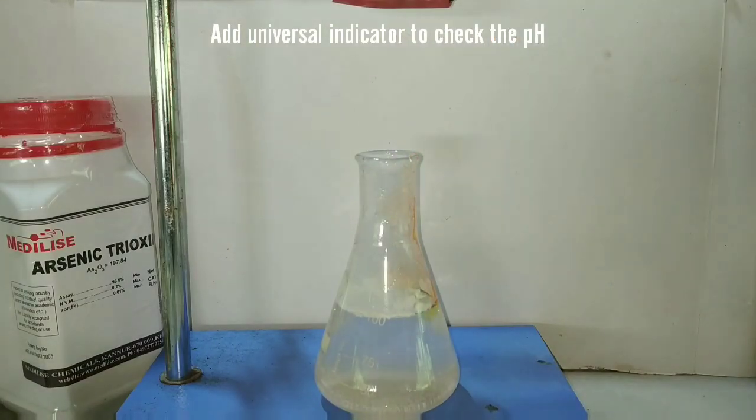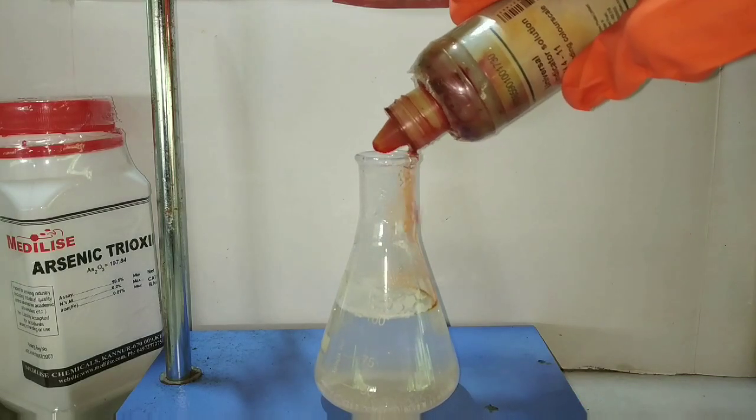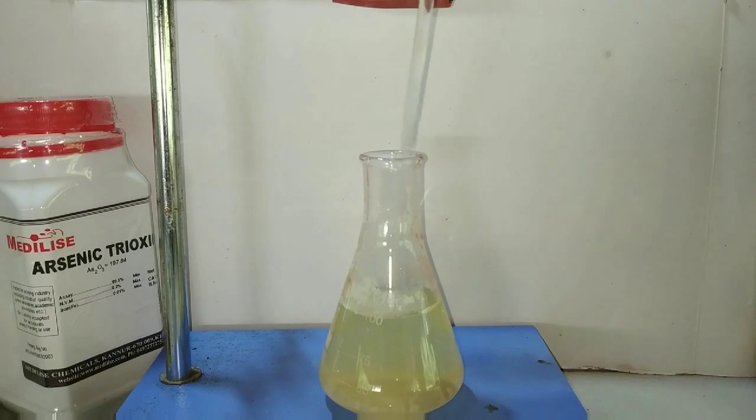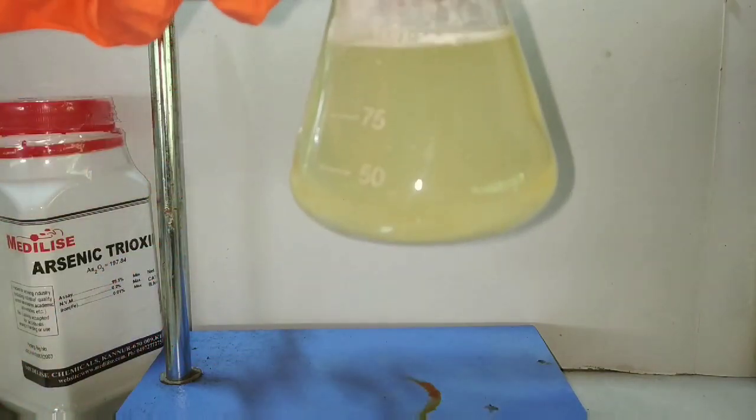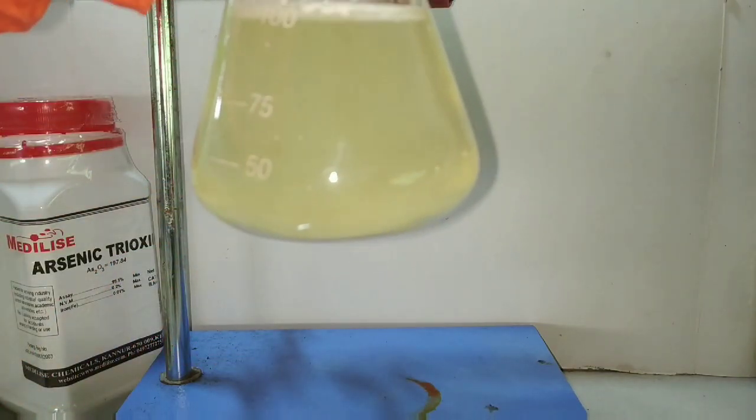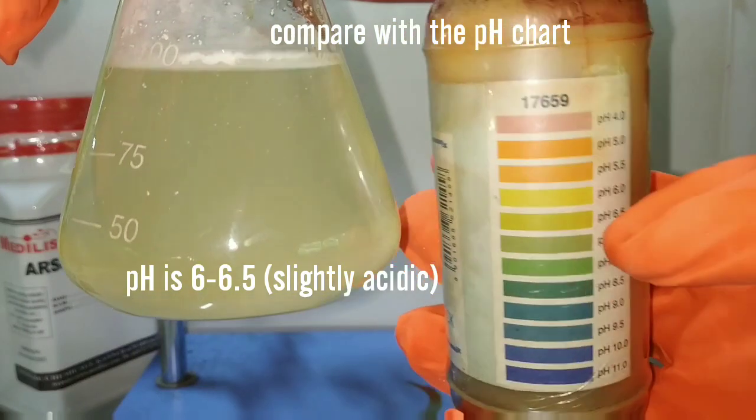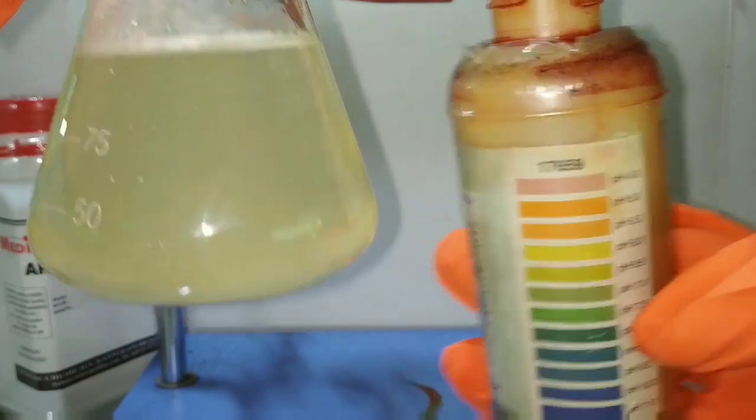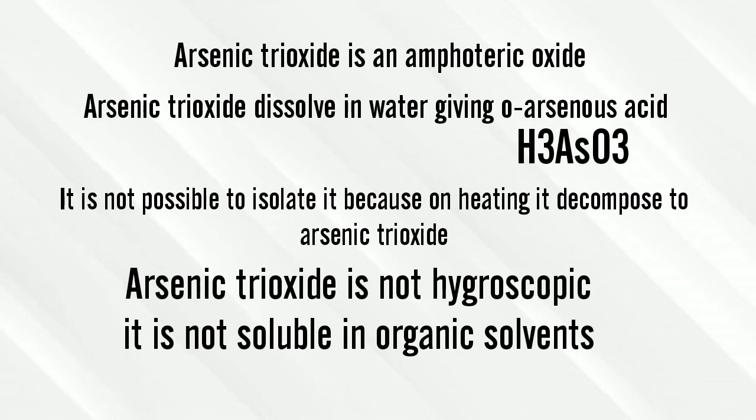Now we would check the pH of the solution. On adding the universal indicator solution it has turned to a yellow color. Now we will compare the color with the color chart on the universal indicator solution. On comparing, you can see that the solution is slightly acidic. Arsenic trioxide is an amphoteric oxide, hence it dissolved in water giving orthoarsenous acid.